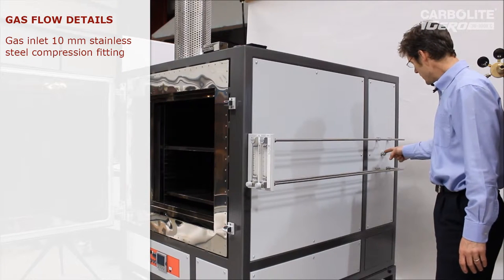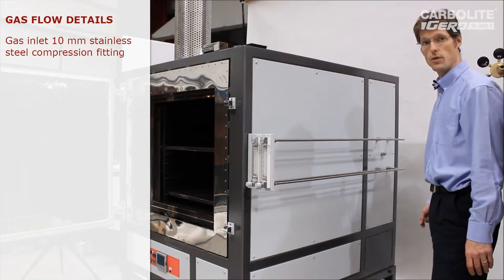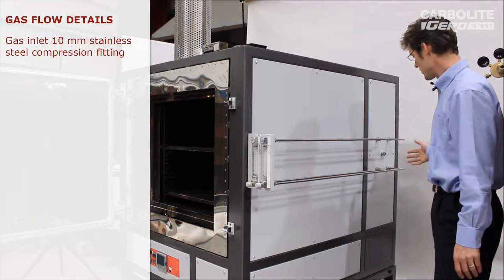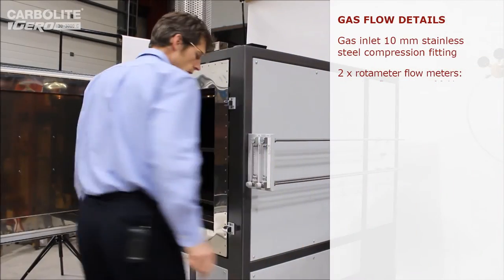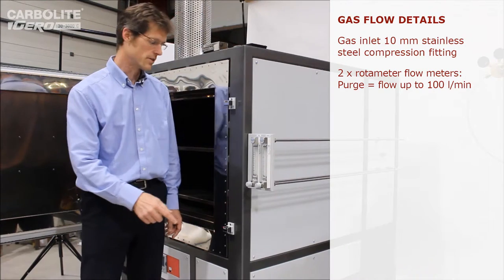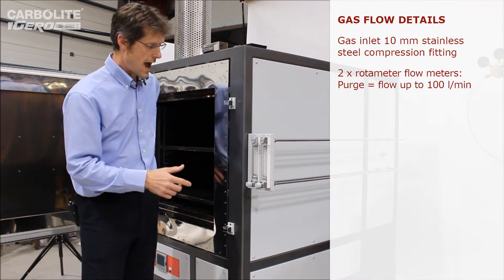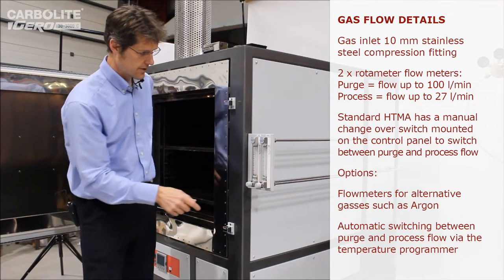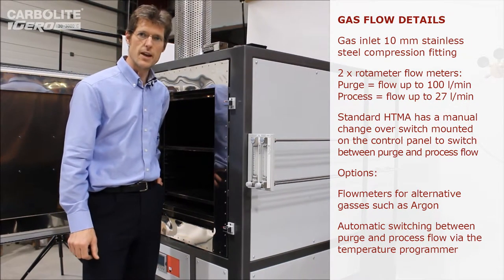The gas inlet to the oven is here — a 10 millimetre compression fitting in this case, though many other fitting styles are possible. There are internal solenoid valves behind this panel which either turn the gas off or direct it to either of two rotameters. Normally you have a relatively high flow — up to 100 litres a minute — used for purging the chamber when it's initially full of air. When the right oxygen level is achieved, the solenoid valves switch over to the process rotameter at a lower flow, just sufficient to maintain the low oxygen level without consuming excess gas.